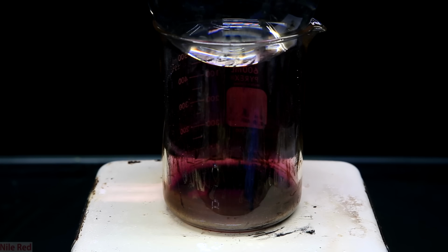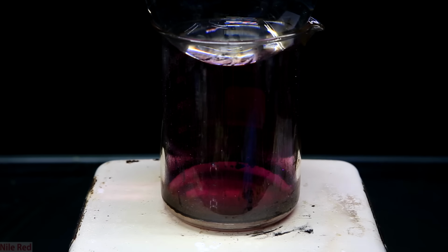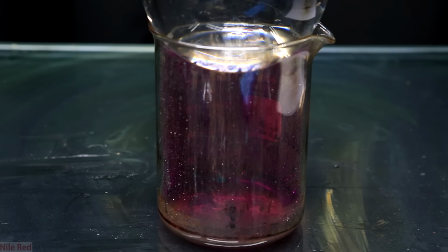Now there still is iodine at the bottom, so we carry out this process again. It's the same thing as before: we heat it until there's a large amount of iodine vapors in the beaker, and then we take it off the hot plate and let it cool. As it cools, iodine crystals will form on the side of the beaker. Once it's cooled down, this is what it looks like.